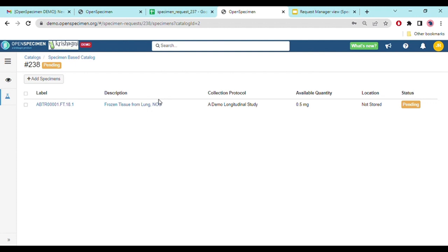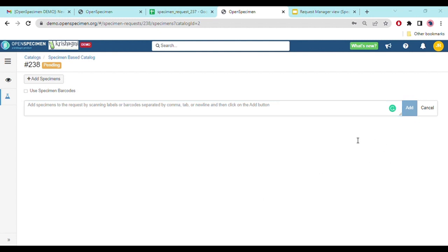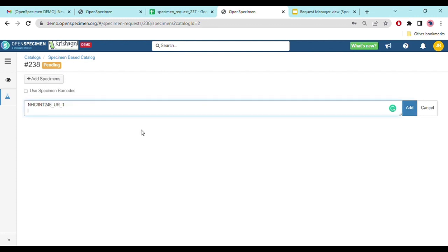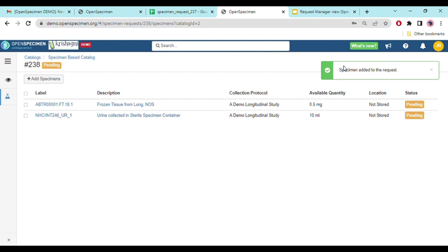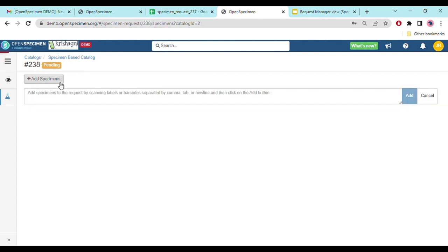Now that the specimen has been removed, I need to replace it with another specimen. You can see the 'Add Specimen' option here. You can paste labels separated by a comma or as a new line. I'll paste a label here, and once I hit 'Add', you can see the specimen is added to the request. Similarly, if you want to use a barcode, that can be done too.